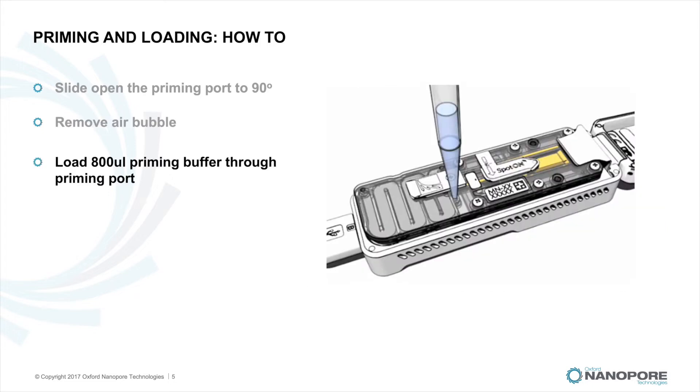Prepare the flow cell priming mix as stated in your protocol and mix thoroughly by pipetting up and down. Load 800 microlitres of the priming mix into the flow cell via the priming port, avoiding the introduction of air bubbles, and wait for 5 minutes.